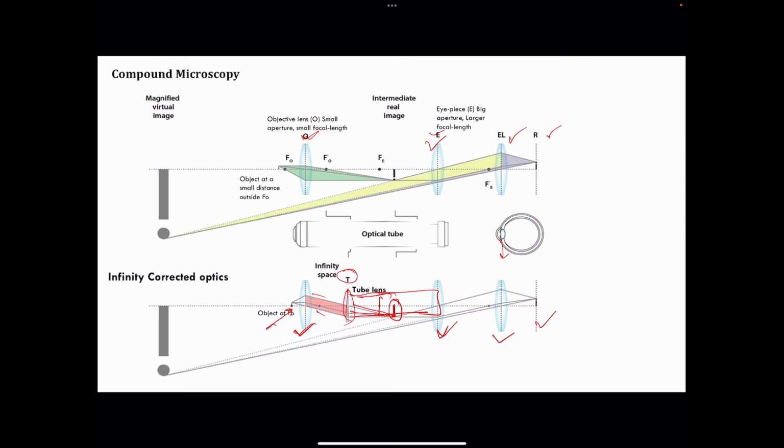For example, certain optical elements that you need to introduce include your polarizers and specific filters. Introducing all of these different optical elements, which are a necessity for different kinds of microscopy in today's world, is going to complicate your optical train and entire optical arrangement very much.